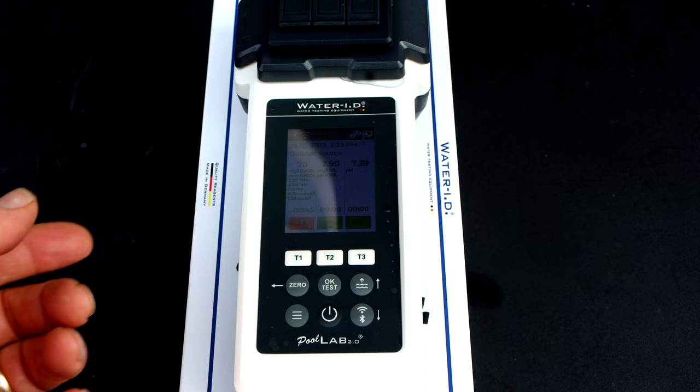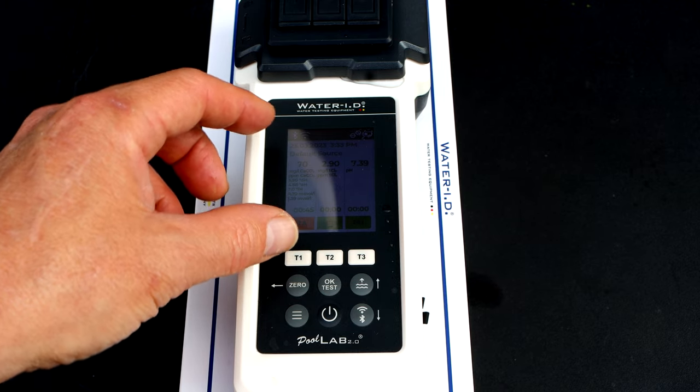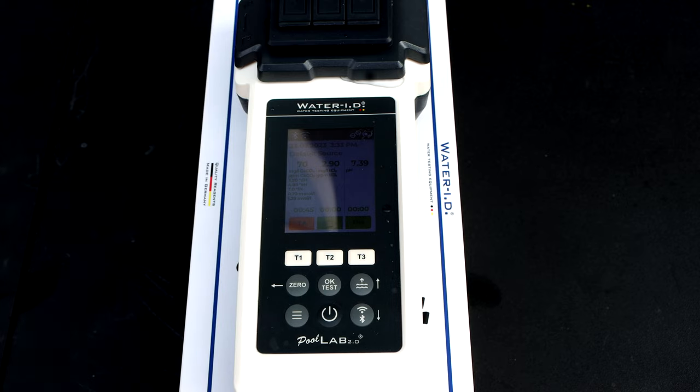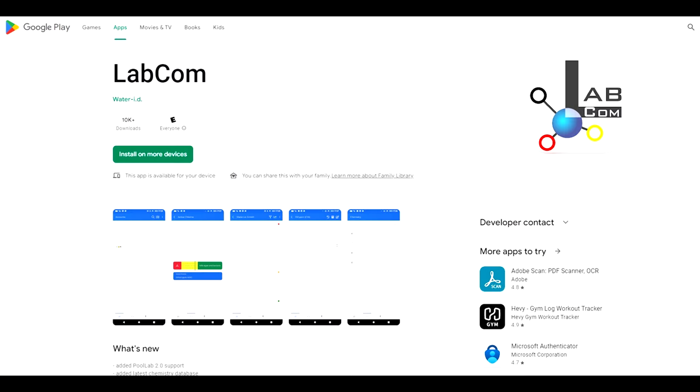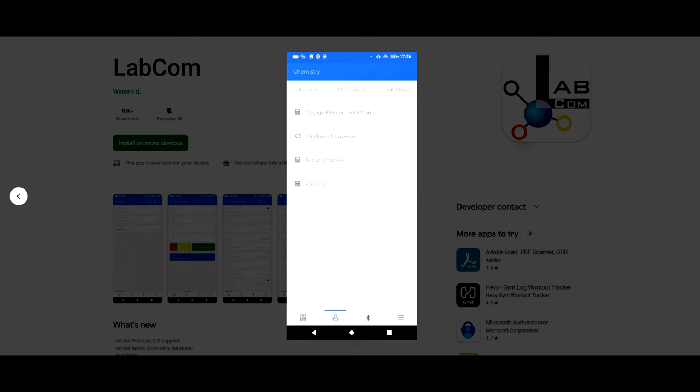The Pool Lab 2.0 or Water Tester in the US market has this really nice 2.4 inch color LED display. The Pool Lab 2.0 or Water Tester is engineered in Germany. You can also send the results through the cloud through the LabCom app on your mobile device or tablet. It's a great way to store the readings and the LabCom app will also give you recommendations.